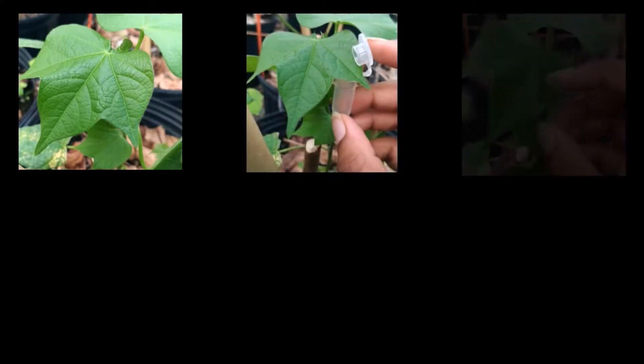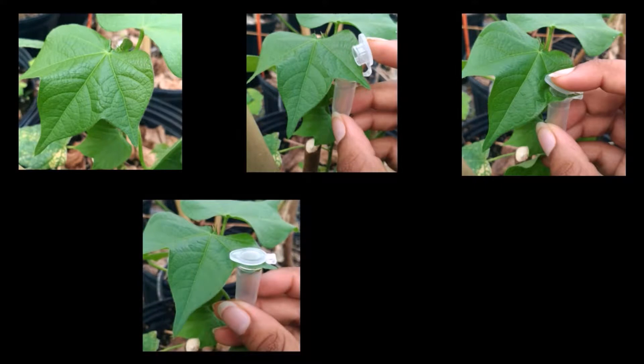The sample is collected from a young leaf and the tube is opened and the leaf is placed between the lid and the tube. It is then closed and detached from the plant.